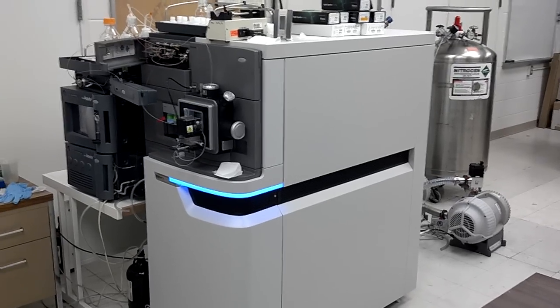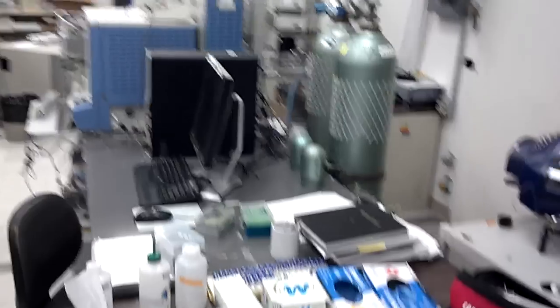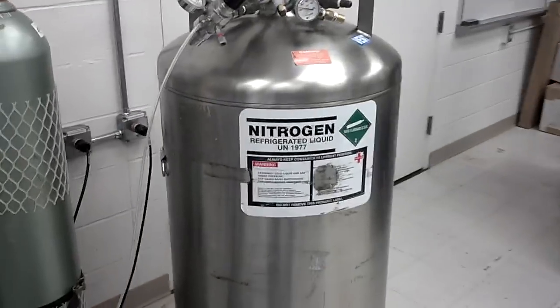Here is the instrument room. We've got plenty of reagents here. This is a mass spectrometer. Looks like a warp engine for Star Trek. Refrigerated nitrogen pumps.